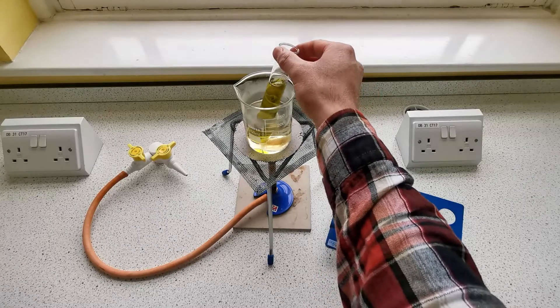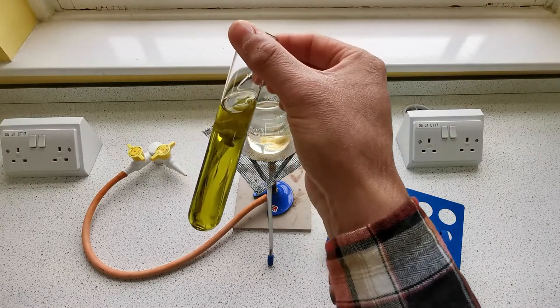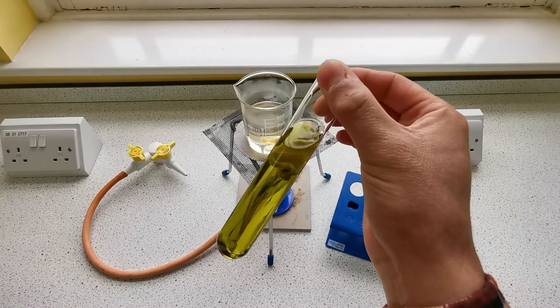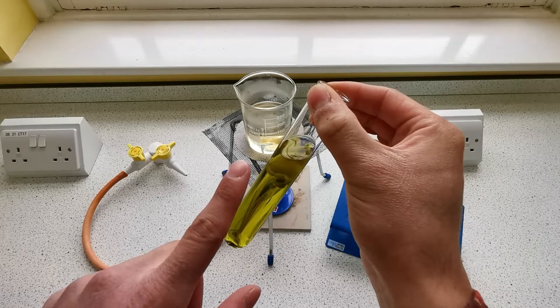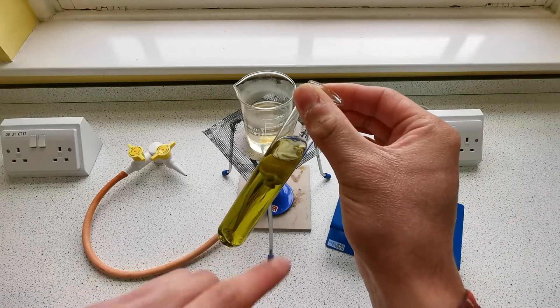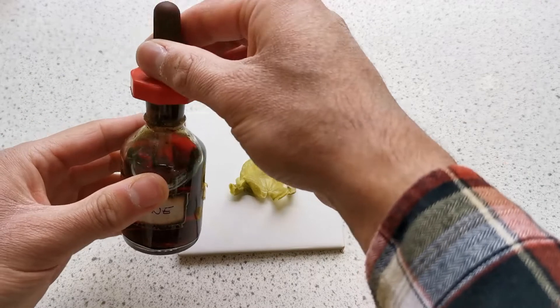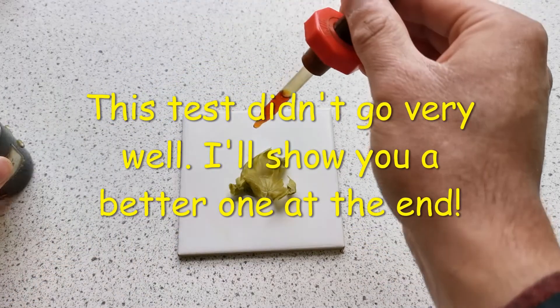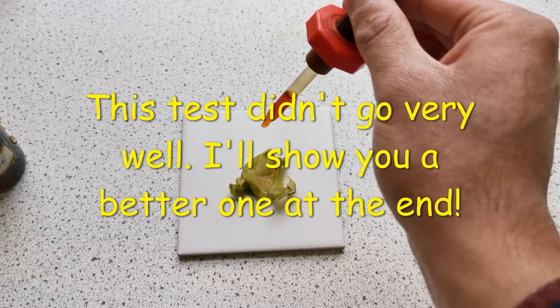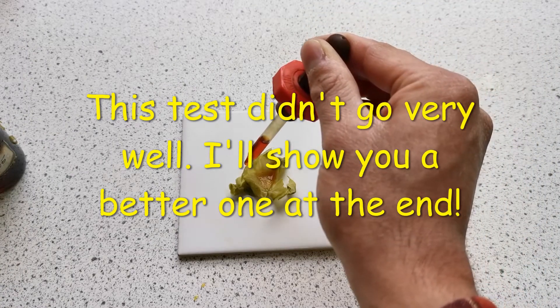As you can see, the ethanol has turned green because the chlorophyll has dissolved out of the leaf into the ethanol. I'm going to take the leaf out using the forceps and spread it on a white tile. Now we're going to take some iodine and add a few drops to the leaf. If starch is present, we should see the iodine turn blue-black.